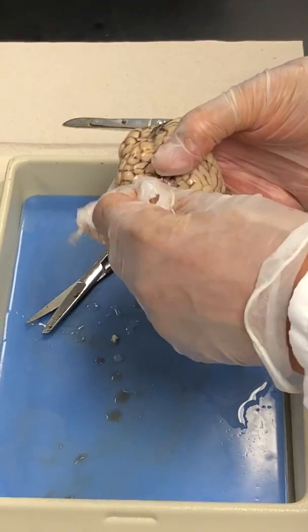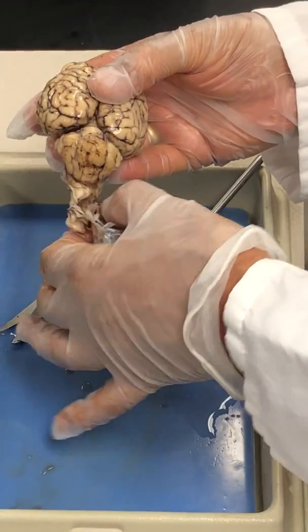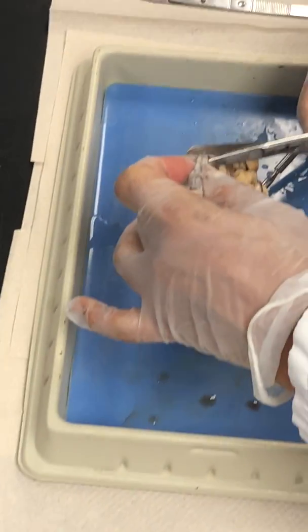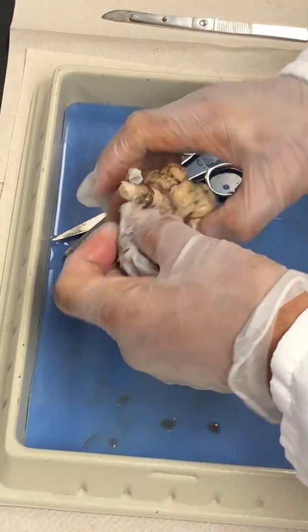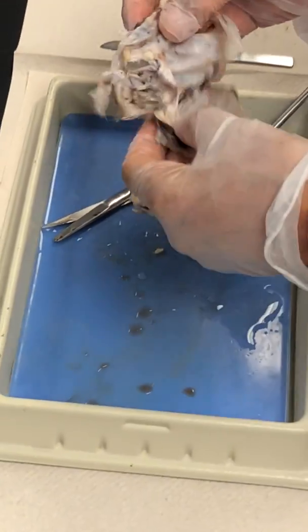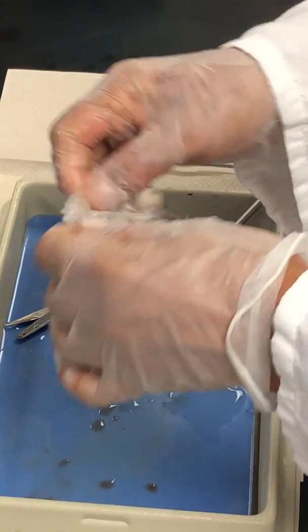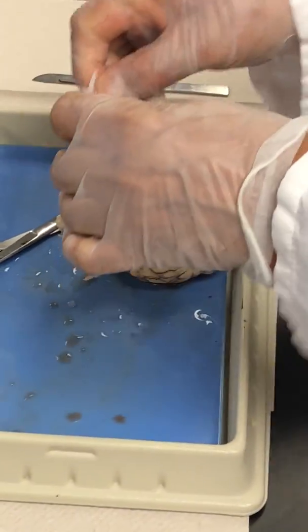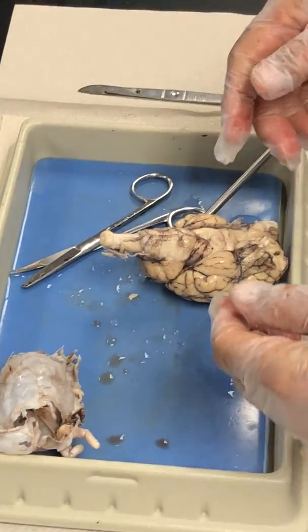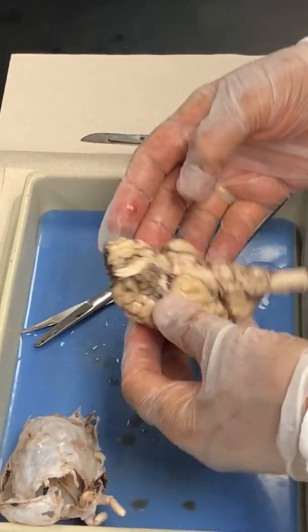So here goes the meninges. I'm actually lucky. I didn't damage anything. You notice that it takes a while to carefully try to get the meninges off. But what you can do after you take it off, if you want to see how tough this is, just try to. You can't rip it. It's very, very tough. Take my word for it. So that's why it's protective. You can put gloves on and try it.